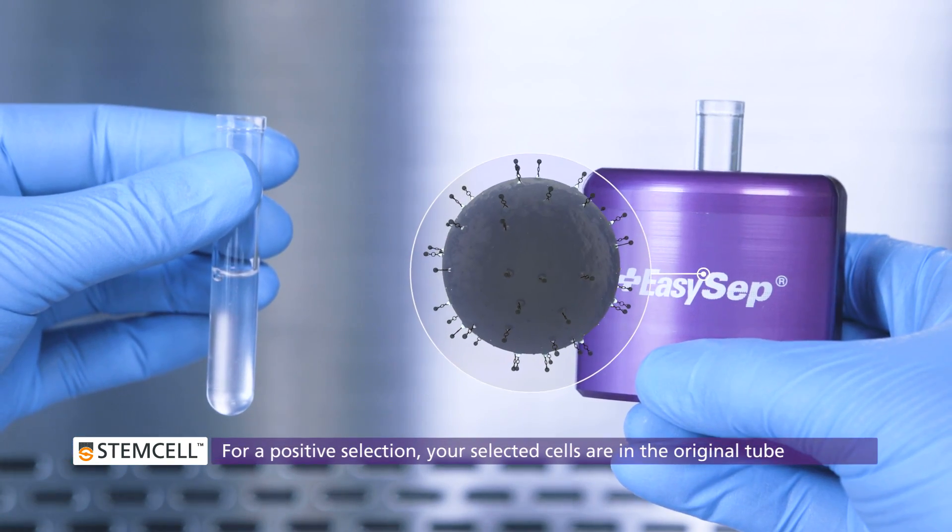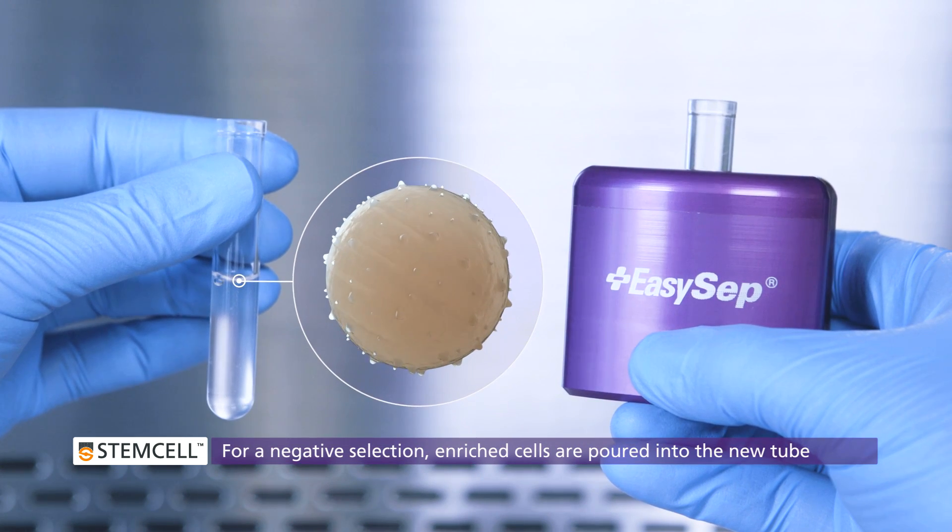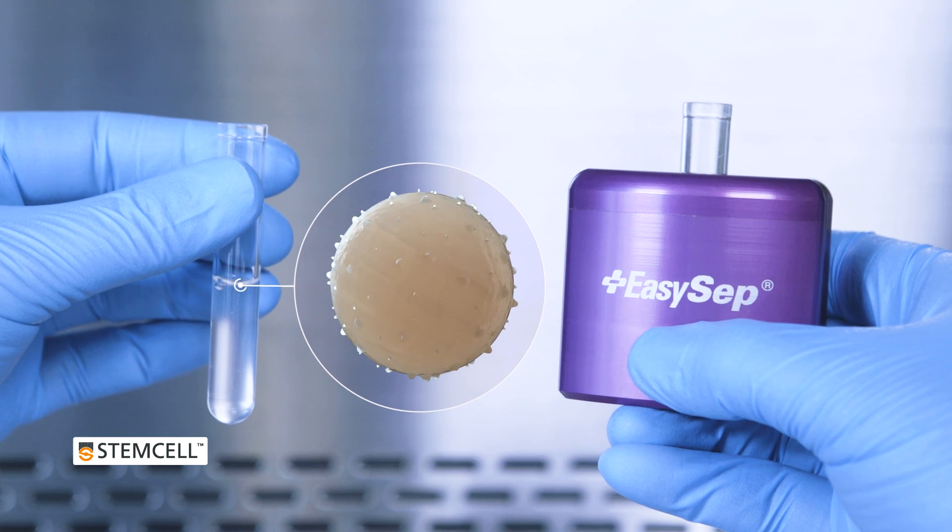If you are doing a positive selection, your selected cells are inside the original tube. For negative selections, your enriched cells have been poured off into the new tube.